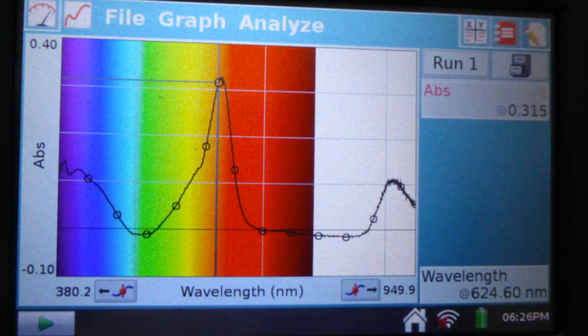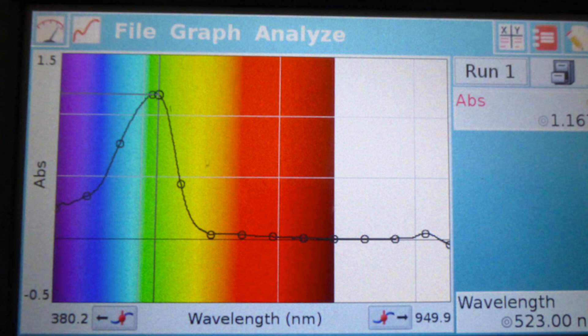The schools with an AP chemistry program will also be getting a SpectraVis spectrophotometer. This is the data that's measured by looking at one of those colored solutions. You can tell that there is a great wavelength of maximum absorption there at 624.6 nanometers. So if you wanted to look at this particular one, then you would go, oh, okay, I need to look at this specific wavelength, not any of those low wavelengths. This is another example of data collected. This is absorbing in the green part of the spectrum at 523 nanometers, indicating that this solution can't be green because, remember, green is either reflected or transmitted, not absorbed in a green solution. The kids should be able to look at data like this and find the wavelength of max absorbance. And, of course, that ties back to the idea that any color of light has a given wavelength, a given frequency, and a given energy associated with it.